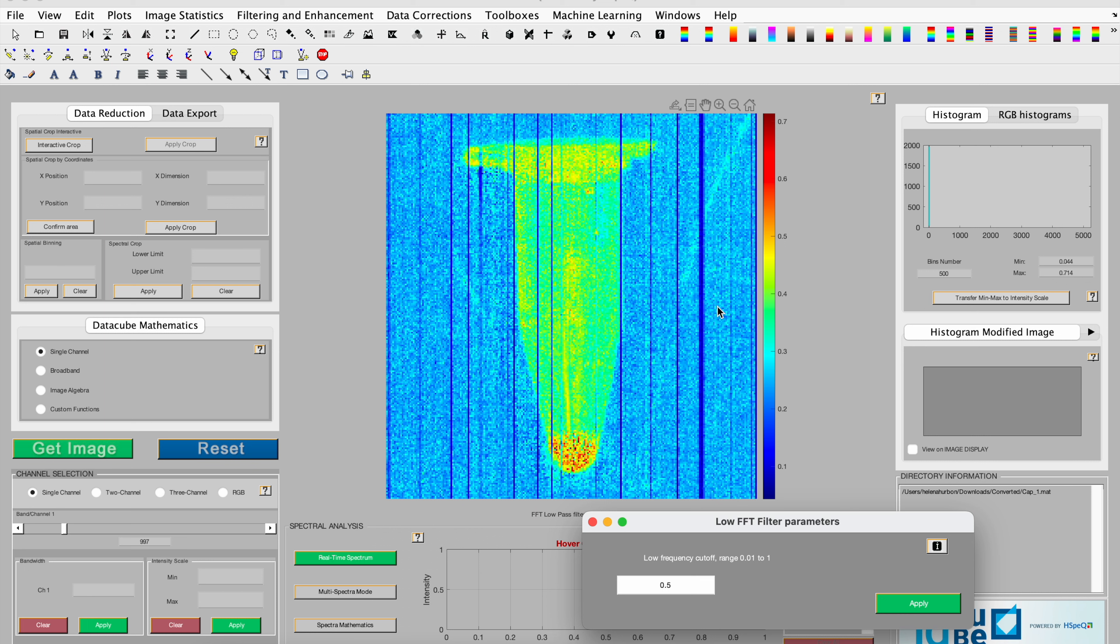Similar to other filters, the processed dataset is temporarily stored and available for other processing algorithms.